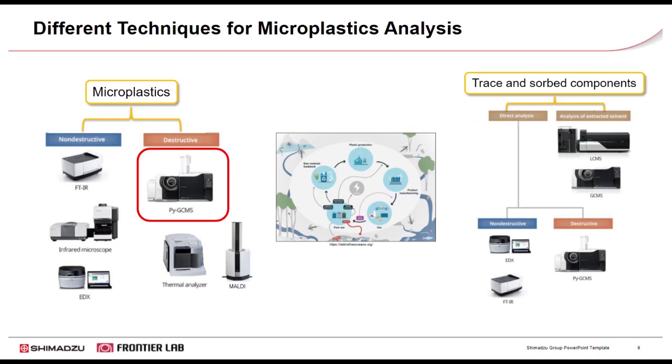In our expedition to find an analytical technique to perform well in all areas of characterization, it is important to understand that there is not one technique to solve the puzzle, but a combination of techniques that complement each other for microplastic analysis. Of course, in this webinar, we are going to shift our focus towards Pyrolysis-GC, one of the most comprehensive analytical methods in characterizing and quantifying microplastics.